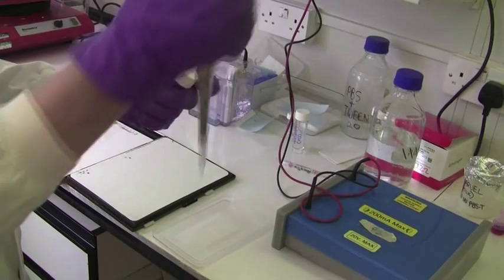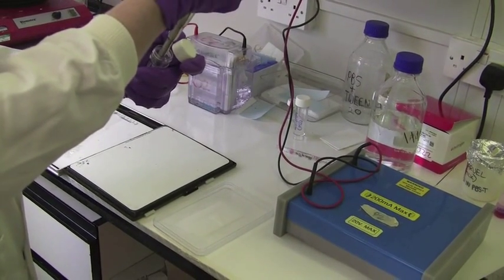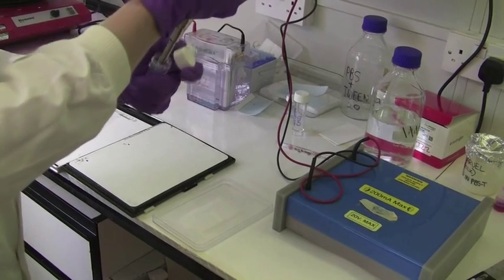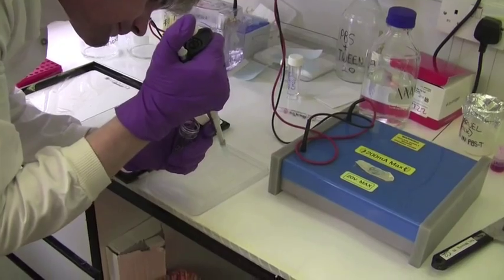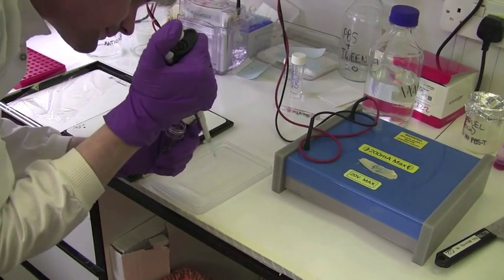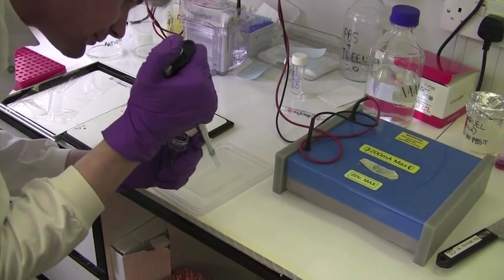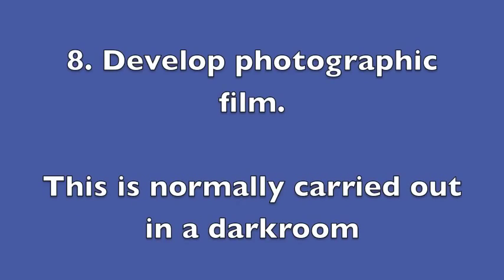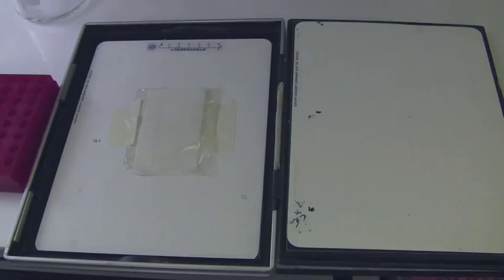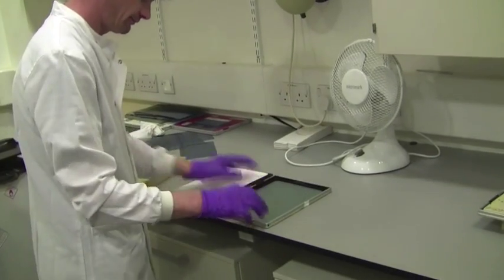Enzymatic detection is a commonly chosen option for Western blotting, and the most commonly used enzyme for this is horseradish peroxidase. Horseradish peroxidase is then detected using chemiluminescence detection substrates. The signal from these substrates is transient. Its sensitivity, coupled with the ability of this signal to be captured on X-ray film or digital imaging equipment, makes it a popular choice for detection.